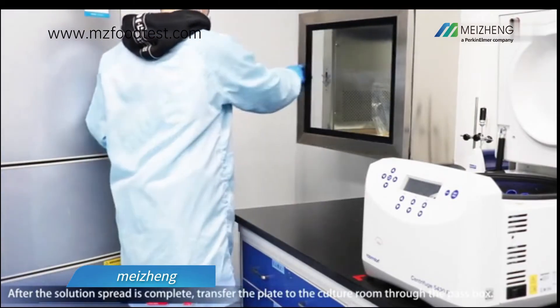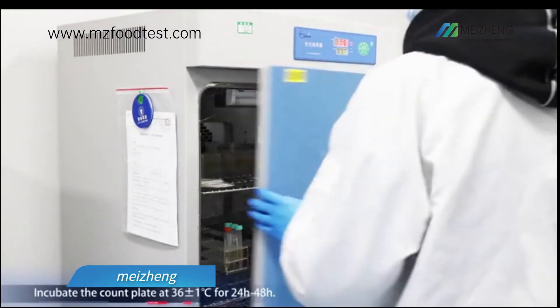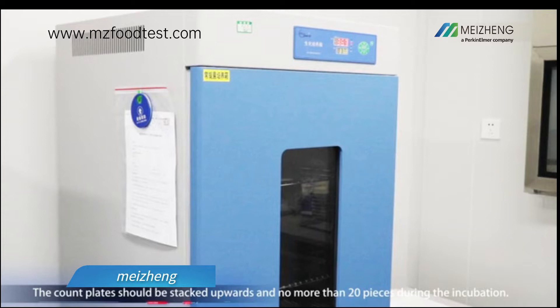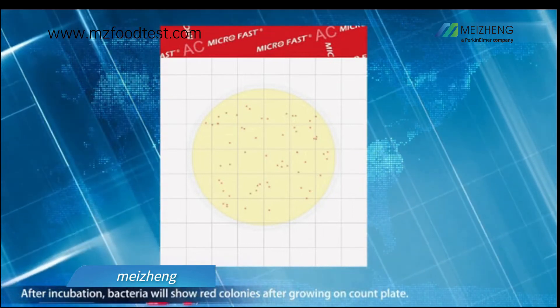After the solution spread is complete, transfer the plate to the culture room through the pass box. Incubate the count plate at 36 degrees with one degree tolerance for 24 to 48 hours. The count plates should be stacked upwards and no more than 20 pieces during incubation.